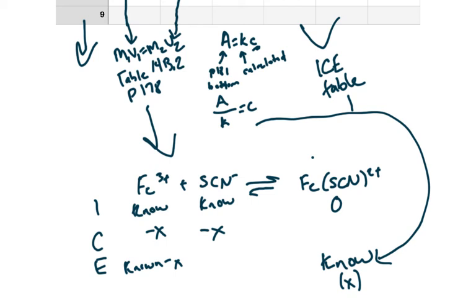You can see at the bottom of page 184, it says representative calculation. So I only need to see one calculation. Just show me the calculation for test tube 6, and for the rest, if you need to write it out, you can do it on scratch paper. If you are unsure of working through this, go ahead and do it on scratch paper and turn that in.